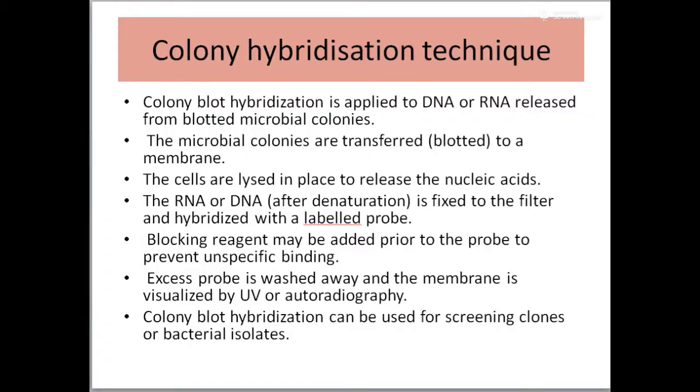Now, how do you do this? If you have an agar plate with different colonies, the DNA as well as the RNA can be released from these microbial colonies.